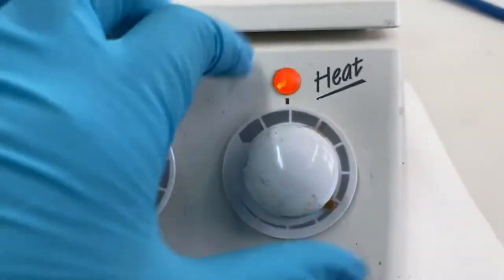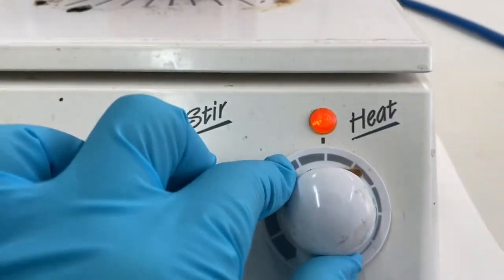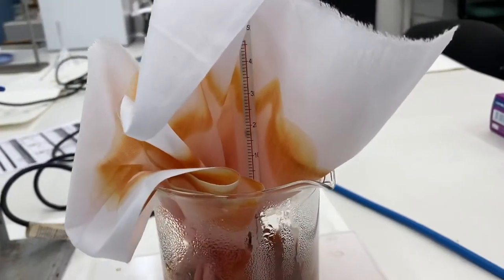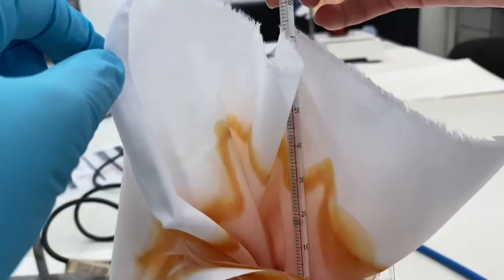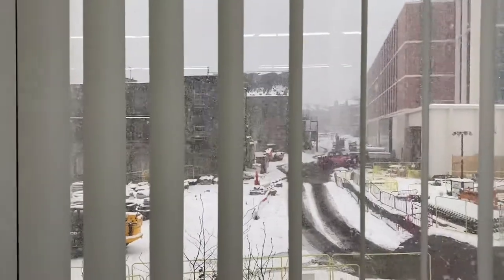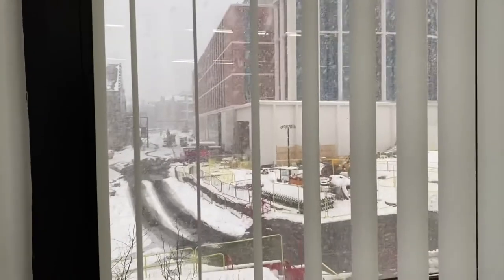Our solutions are then heated up to 70 degrees Celsius so that we can extract the dyes. Be careful not to get distracted by the Scottish weather because these Bunsen burners can get quite hot. Once we hit 70 degrees Celsius it's time to move on to the next step.